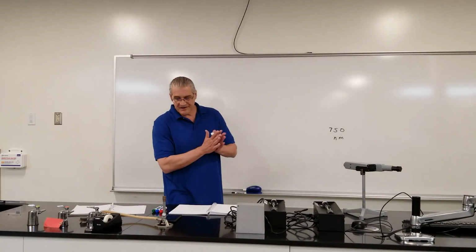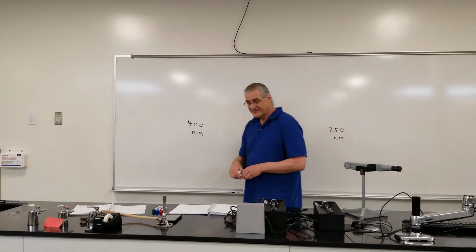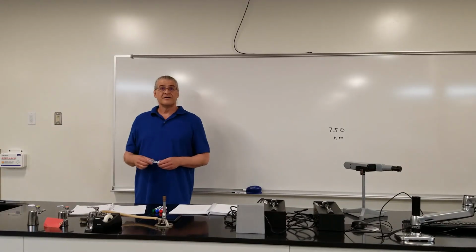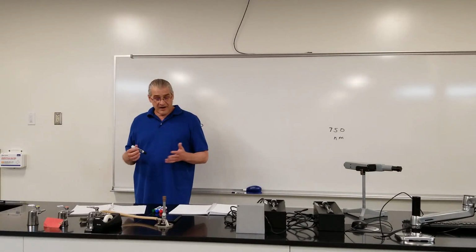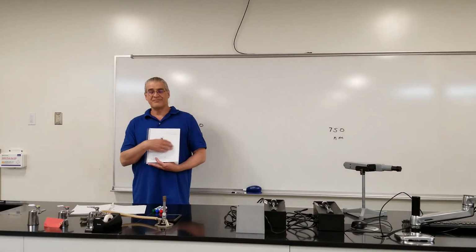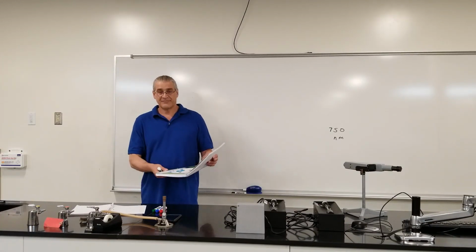Video demonstration of our Characterizing Elements experiment. I'm Joe. I'll be explaining the background of the experiment, and then we'll start showing you the types of data that you should be collecting. You'll all be getting report sheets, the report sheets you would normally fill out. We'll send those to you by PDF with some data that we've scribbled in there for you, and you'll be able to complete your labs.